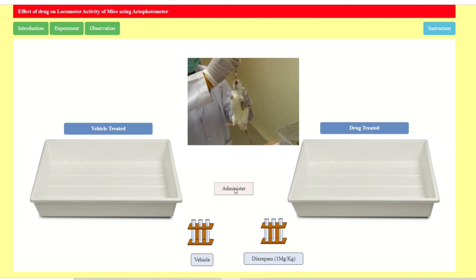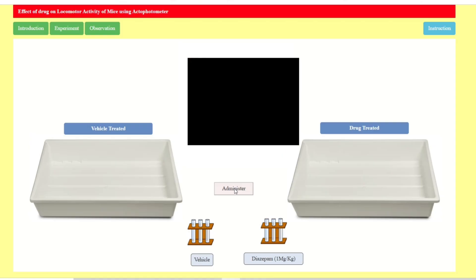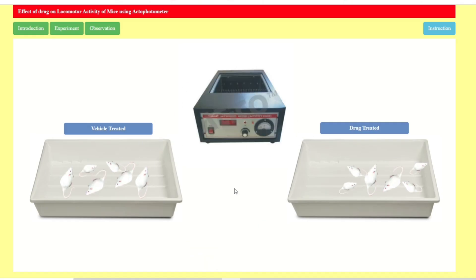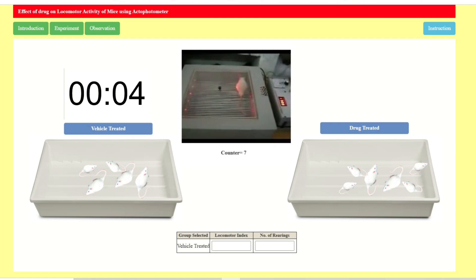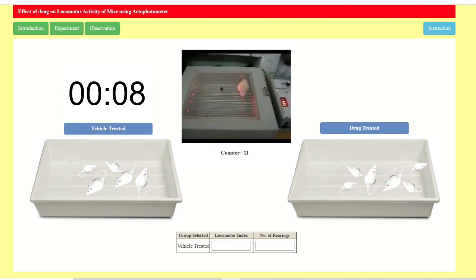Now animals will be divided into the two groups. We will start by screening the first animal from the vehicle group to see what count it gives. We will screen one animal from each group and then analyze the results. Because this is time-consuming, I will speed up and show you the result after screening one animal from both groups. We will click the first animal.